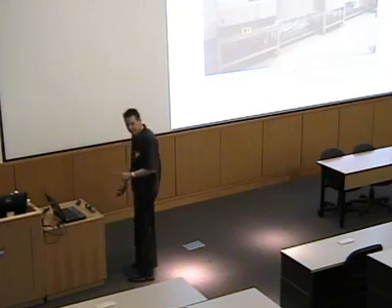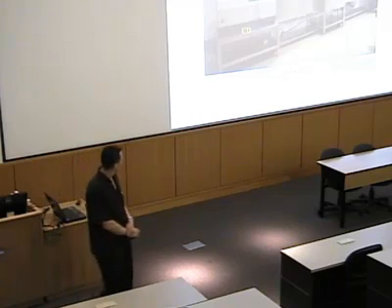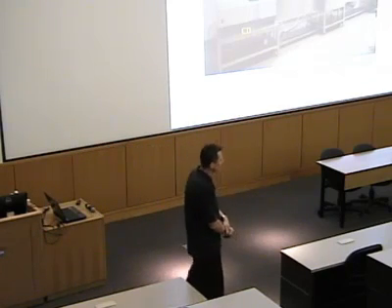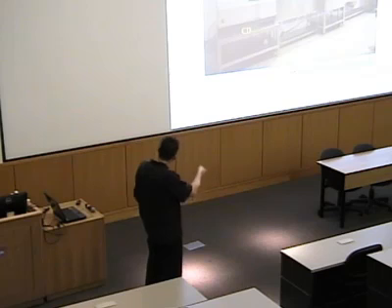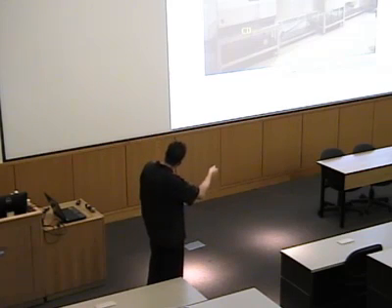So here's the experimental setup. The experimental setup is not that complicated. We just need these two components, the CD and the magnet, and we need to bring them together, right? Just like in Michael Faraday's experiment. So here's our CD spectrometer. Now it looks a bit more sophisticated. And then here is the cryomagnet.